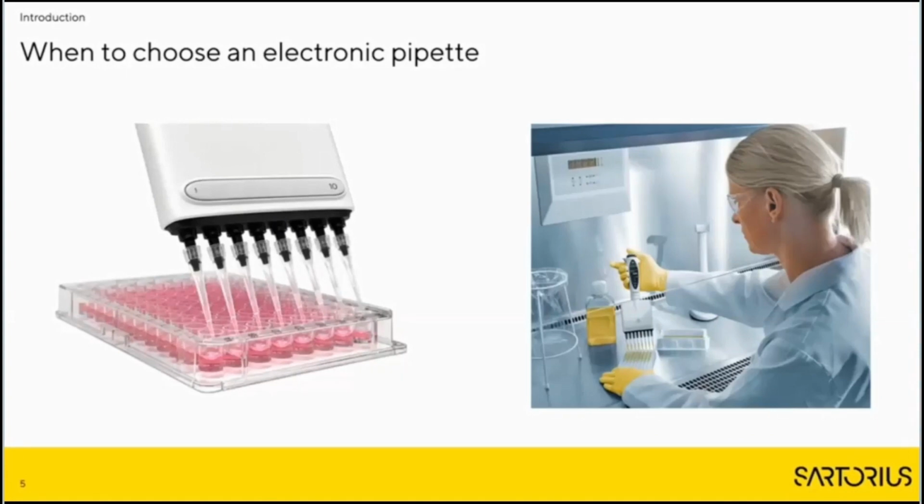Another reason you might move towards electronic pipettes is if an employee has suffered from some sort of injury due to heavy pipetting with mechanical pipettes. But there are some other reasons you might consider switching to electronic pipettes, and this is what we're going to discuss next.